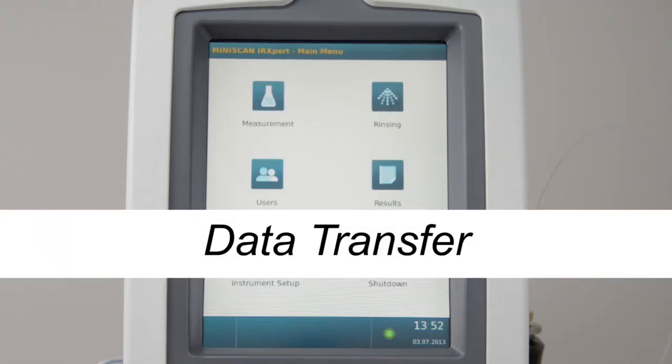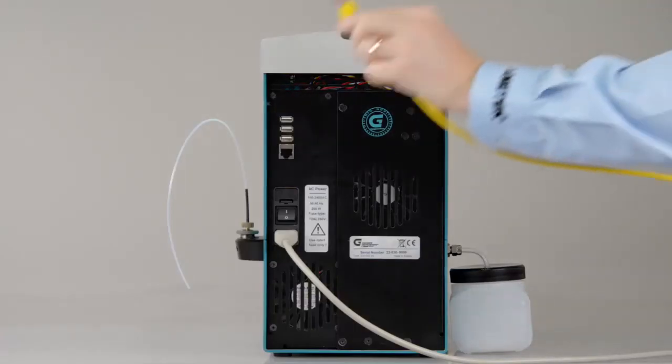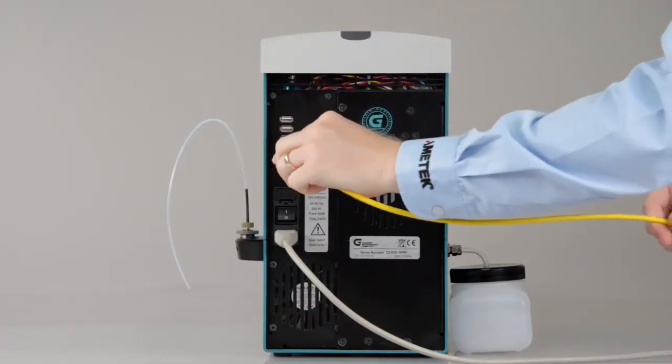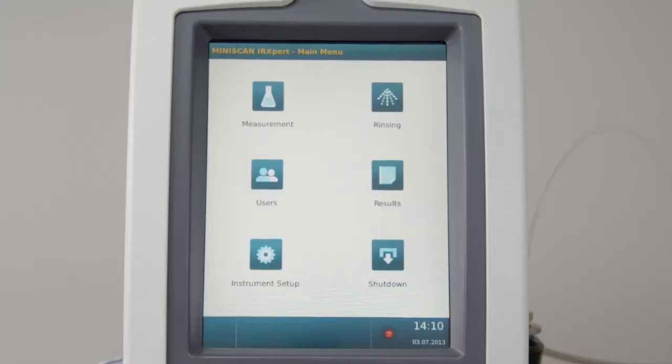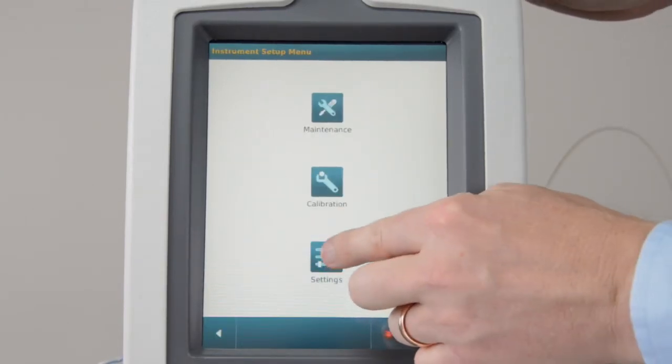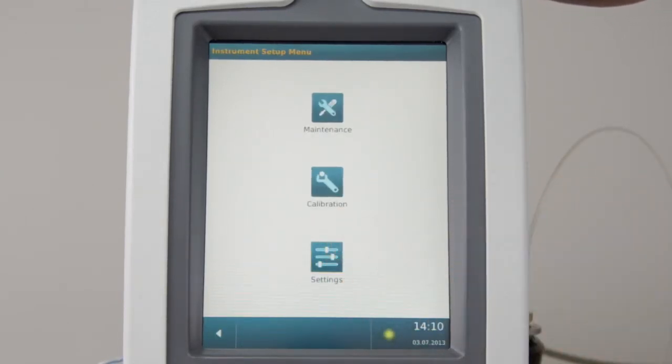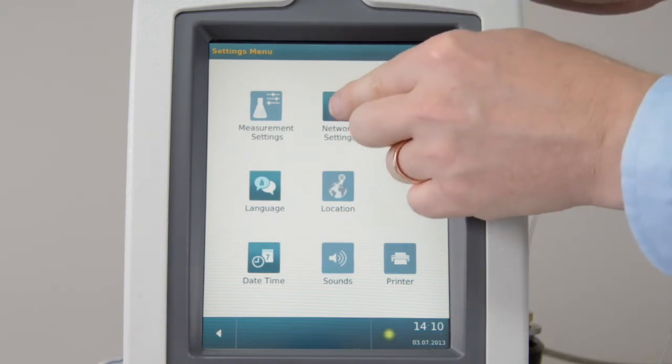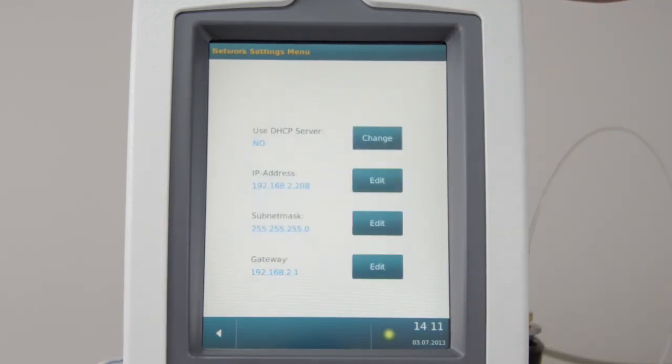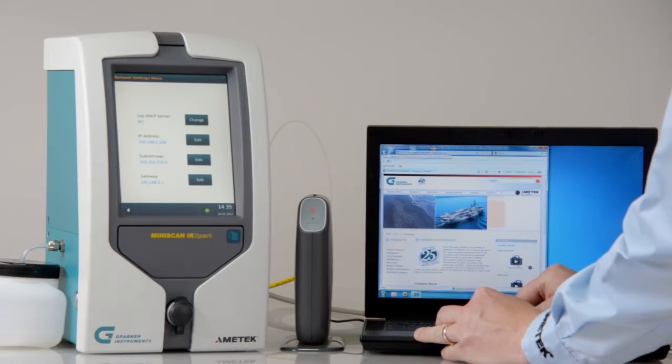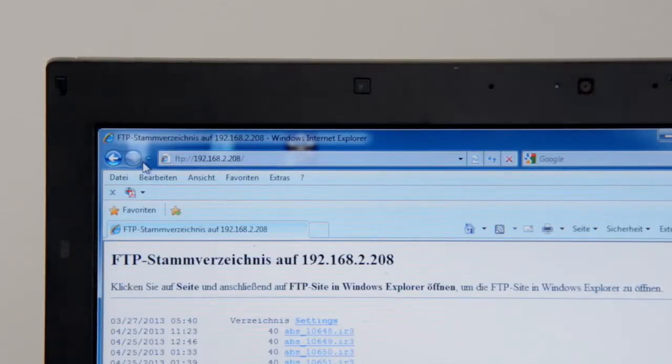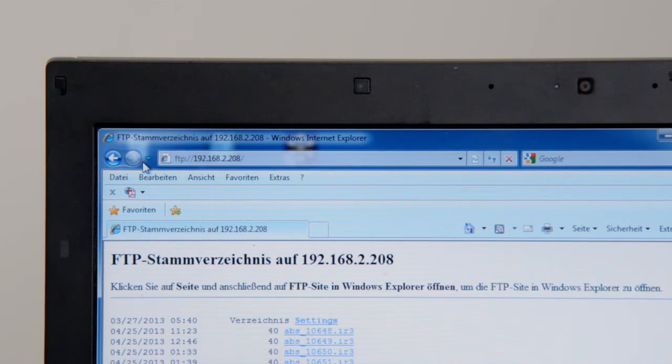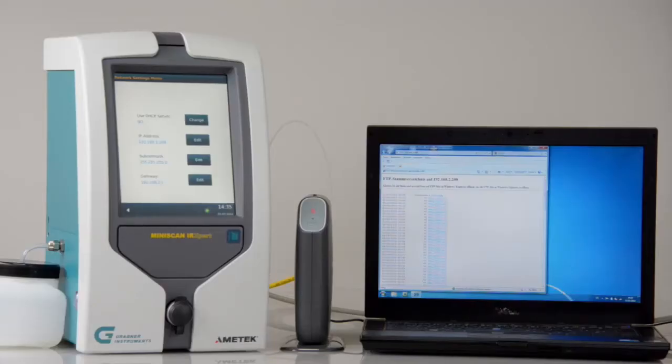Data Transfer. To connect a PC, a network, or to LIMS, connect an Ethernet cable. Go to Instrument Setup. Select Settings and Network Settings. Note down the IP address. If your computer is in the same subnet, open a browser and establish an FTP connection. Here, you will find all results in designated folders, which can be downloaded through a LIMS.